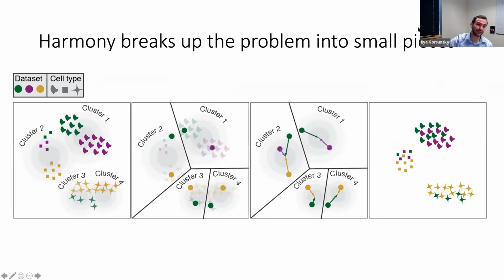And it's actually, sometimes it happens. Sometimes it is really orthogonal. PC1 is cell type, PC2 is batch effects. Most of the time it's not. Most of the time there's batch effects that are very much correlated with cell type. In fact, that's the interesting cases. And Harmony seems to do fine there. We haven't seen the case yet where batch effect makes a T cell look like a B cell from another batch. As an extreme example, we haven't seen anything like that yet. But we definitely don't assume any orthogonality.